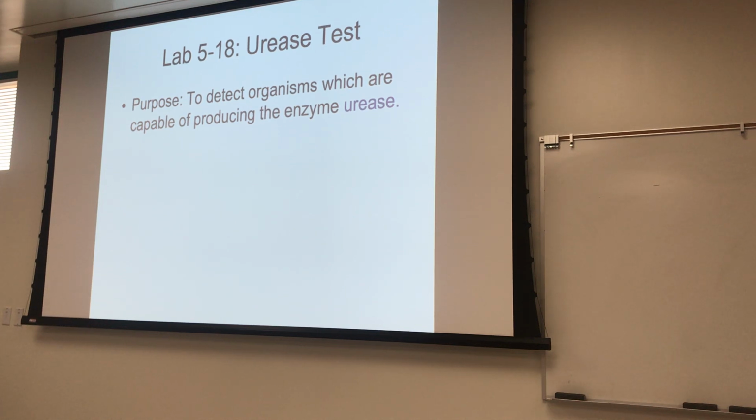Simple because it's just one color that we're going to look for. But I think the cool part about it is that it has a direct clinical application. The direct clinical application is that this is the test they use a lot to help diagnose people for ulcers. When they get ulcers, they'll actually rely on the urease test.